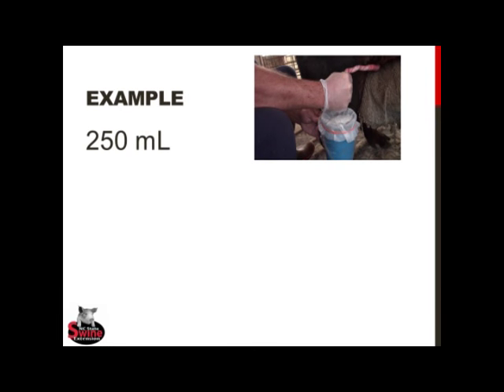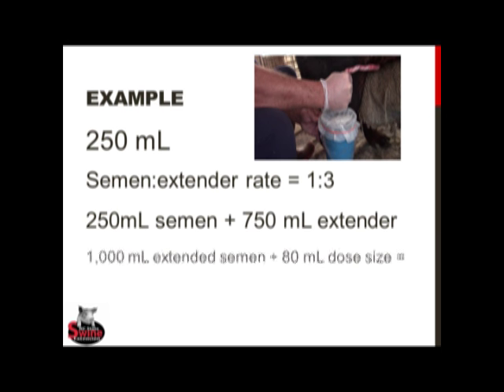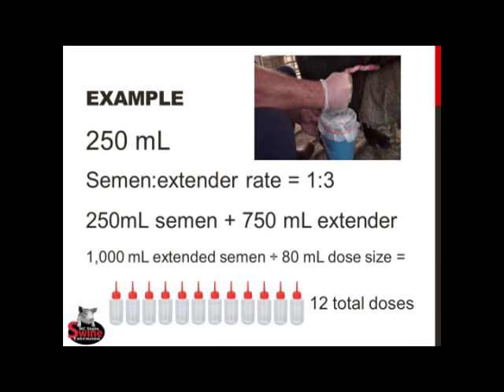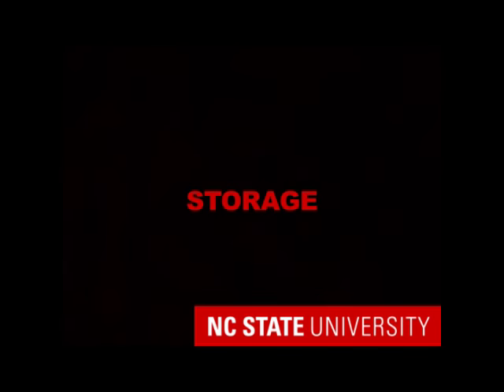In another example, let's say we've collected a boar that produced 250 milliliters of semen, but it was lighter in color and more closely resembled skim milk. In this case, we'll use the 1 to 3 semen to extender rate, meaning we need to add 750 milliliters of extender for a grand total of 1 liter of extended semen. Divided by the desired 80 milliliters per semen bottle, we find we can make 12.5 doses. Again, we'll add the remainder to the other bottles, leaving us with 12 bottles of semen, each containing a little more than 83 milliliters. The semen is now ready to be used or stored for future use.